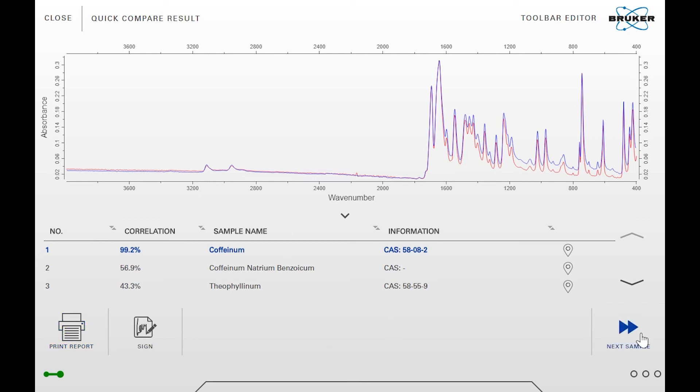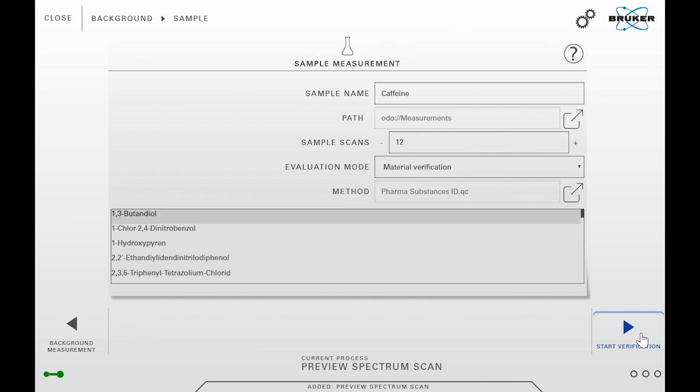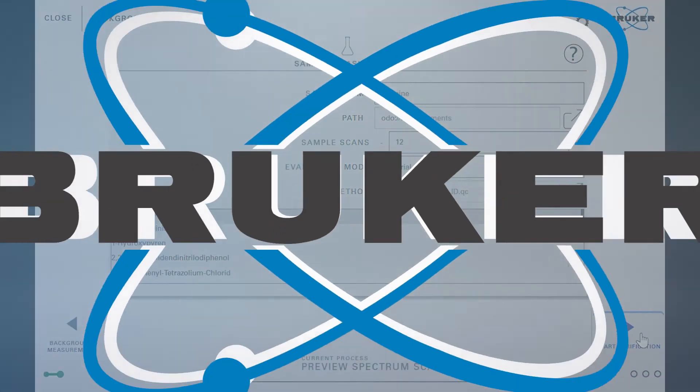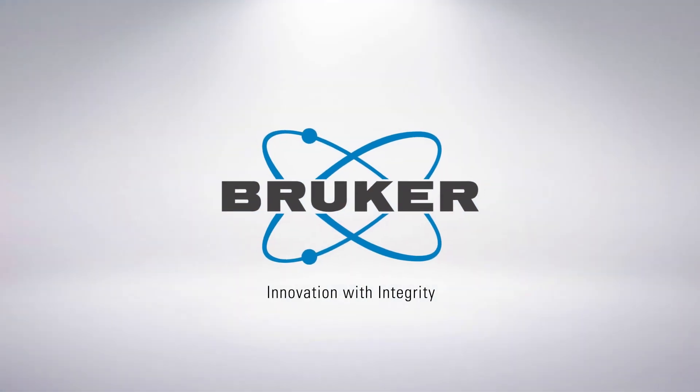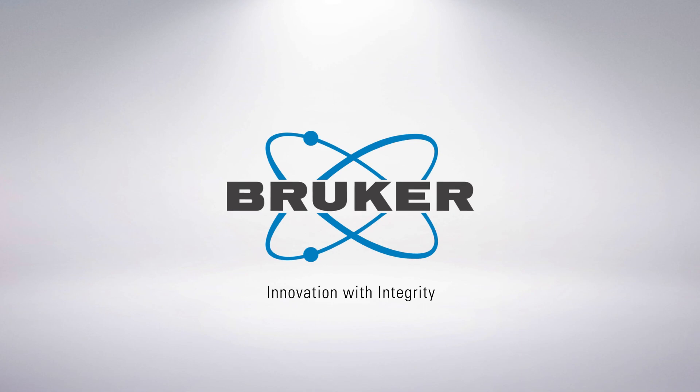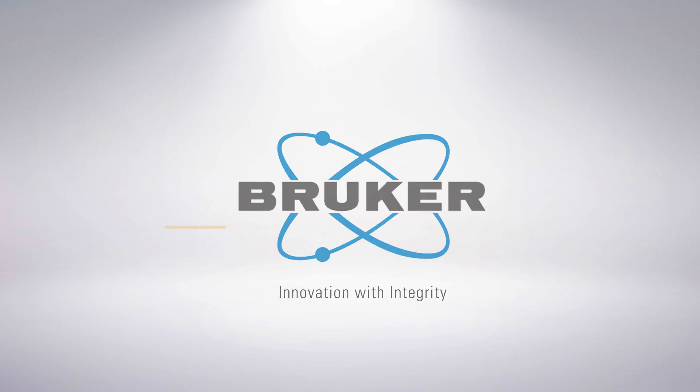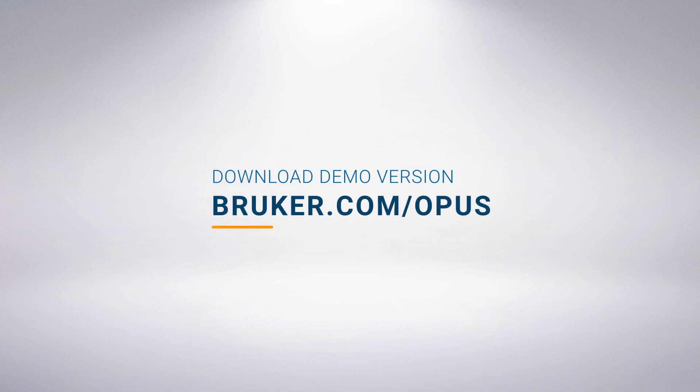Now you know how to use the verification workflow.